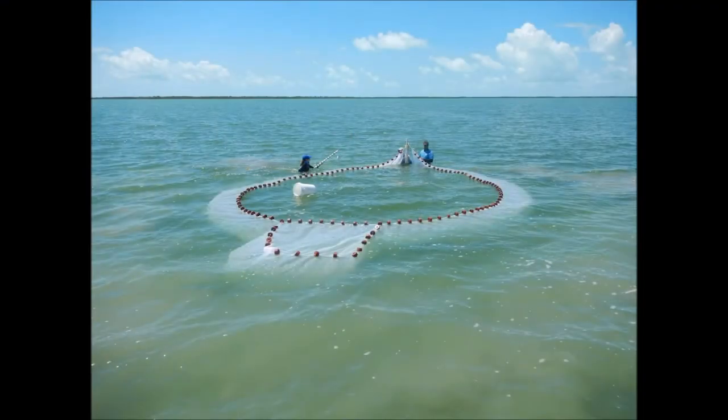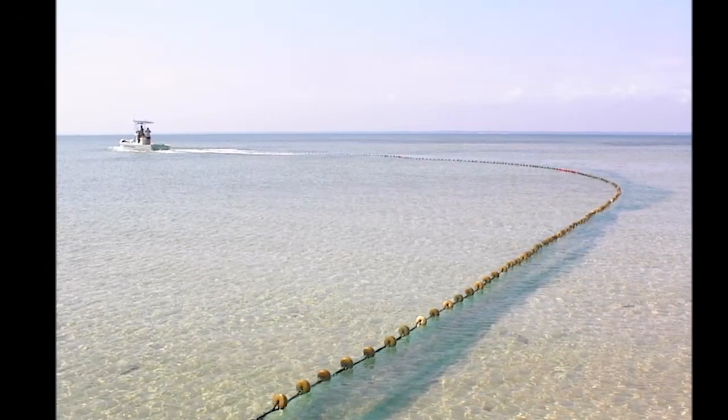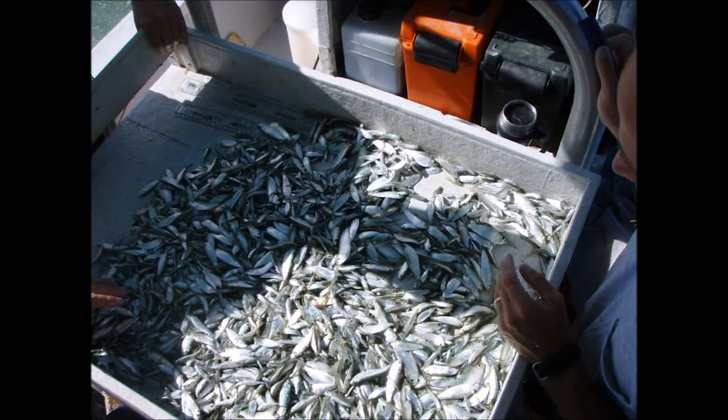The remaining 30% of otoliths that come to our lab for aging were captured using scientific sampling. These are often fish that are too big or too small to be captured within the fishery.